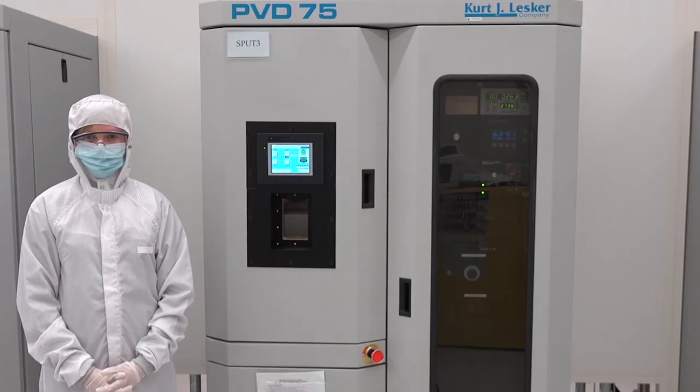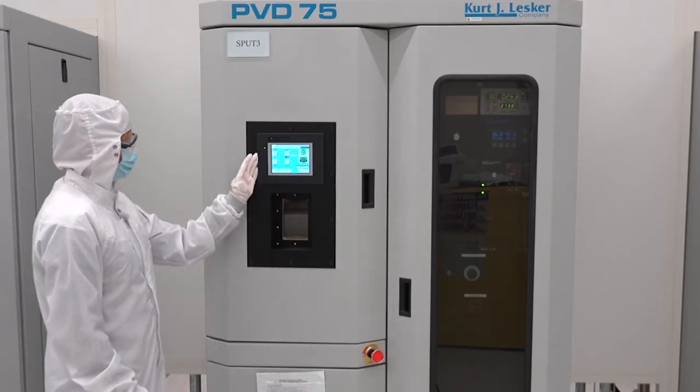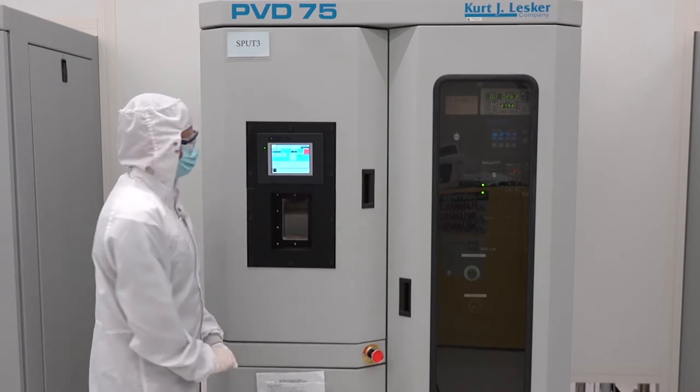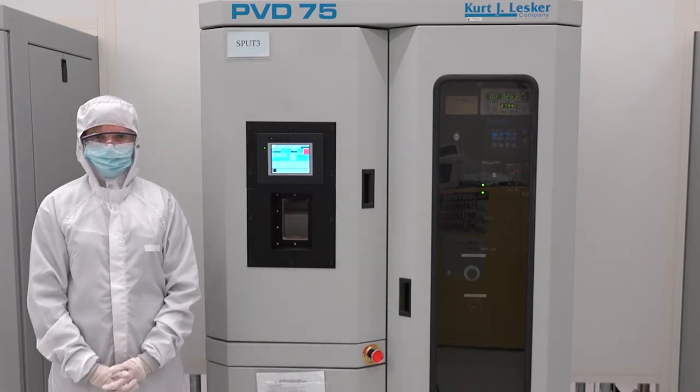So the first step to use the sputter tool is to vent the chamber. This means that a small valve is opened that lets nitrogen gas into the chamber. Nitrogen is used because it is clean and free of any moisture. We vent the chamber using the touchscreen. It takes several minutes for enough nitrogen to fill the chamber and let the chamber pressure equal the room pressure. Then we can open the door to the vacuum chamber.